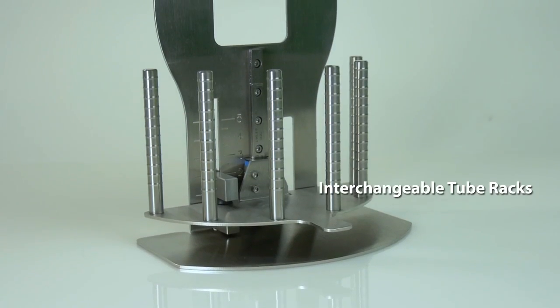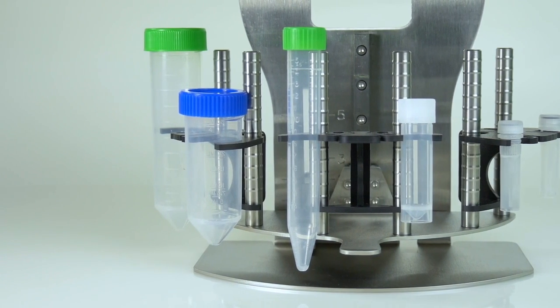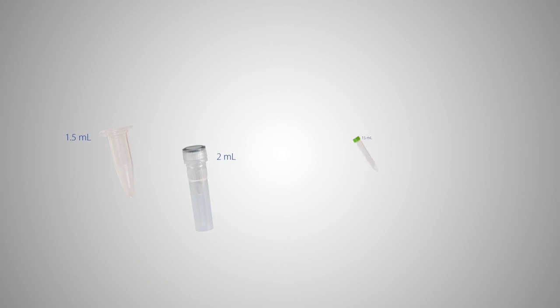The OmniPrep 6 is configured with interchangeable tube racks to support sample processing in a variety of sample tubes from 1.5ml to 50ml.